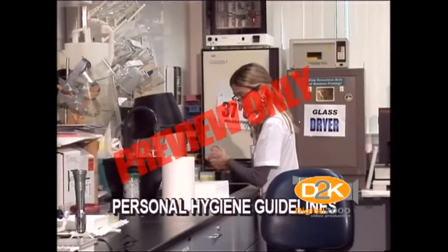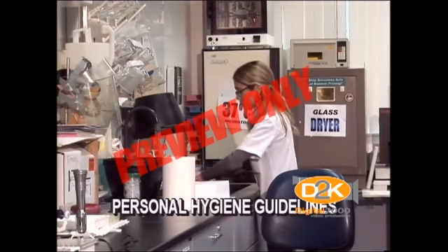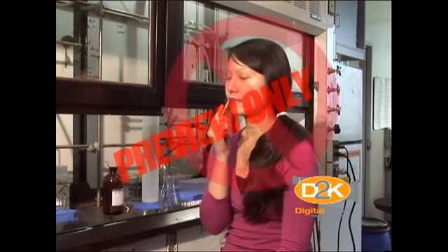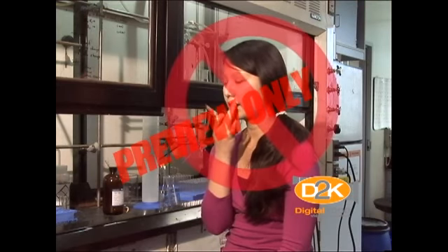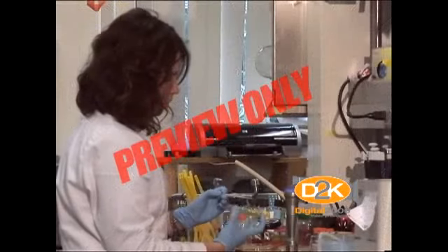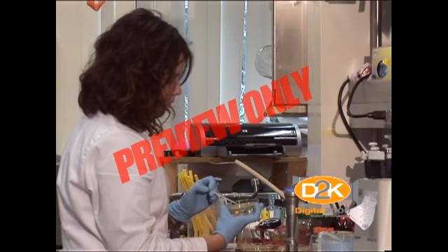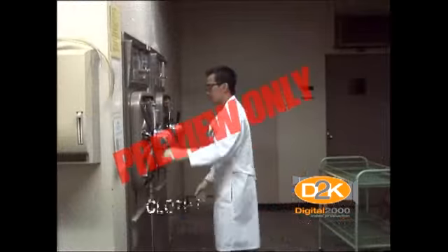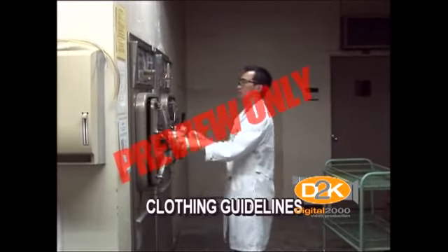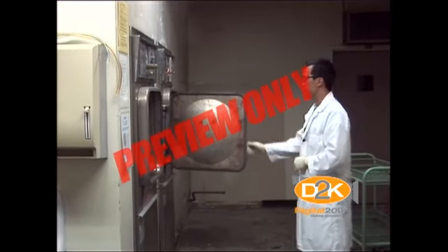After working with any biohazard, you must wash your hands thoroughly. In addition, you must wash your hands after removing gloves or any other personal protective equipment known as PPE, or before eating, drinking, or applying cosmetics, or before leaving the laboratory area. You should never touch your face after working in a biohazardous laboratory or after handling biological material. As with all hazardous or potentially hazardous material, persons working with biological material must wear a lab coat, eye protection, gloves, and shoes that fully cover the feet.